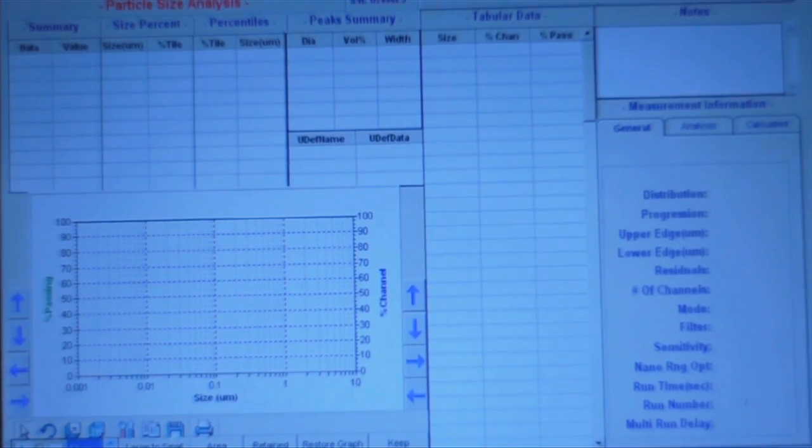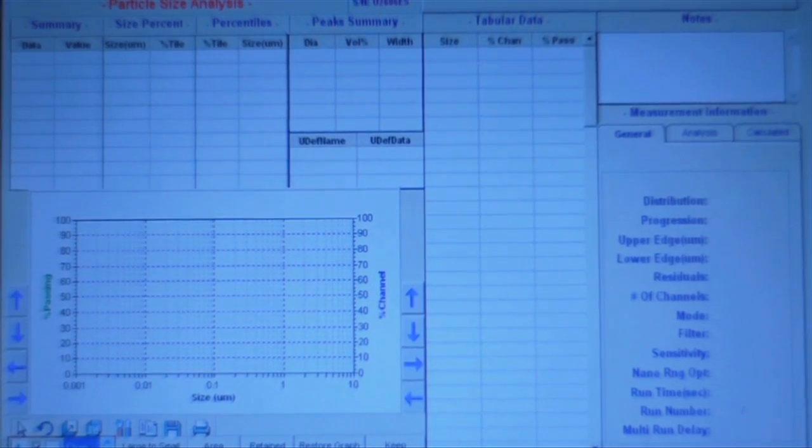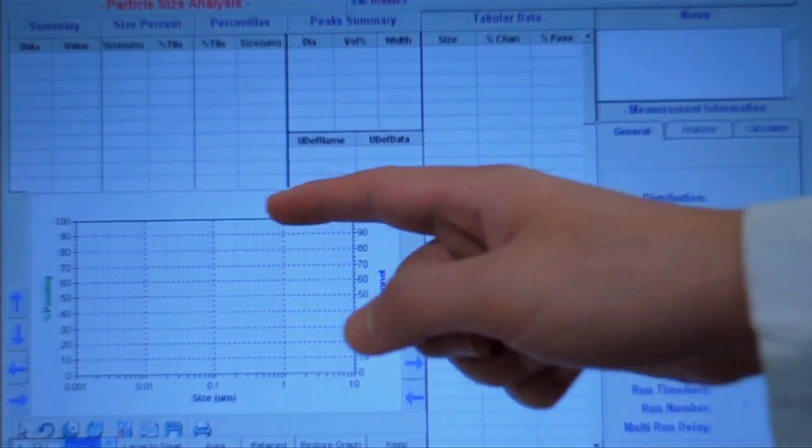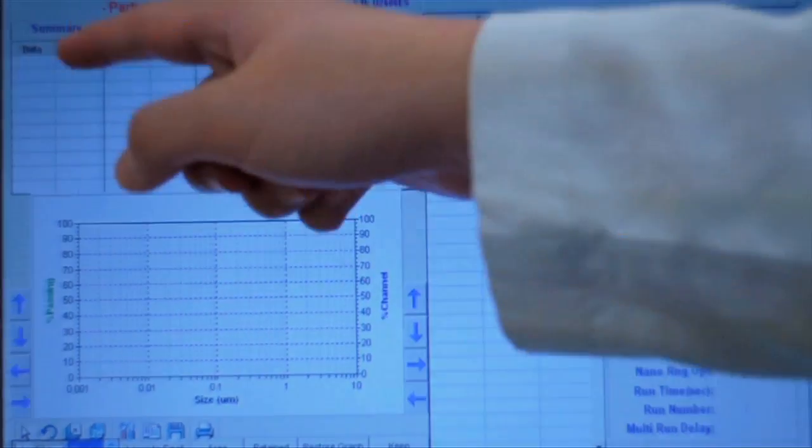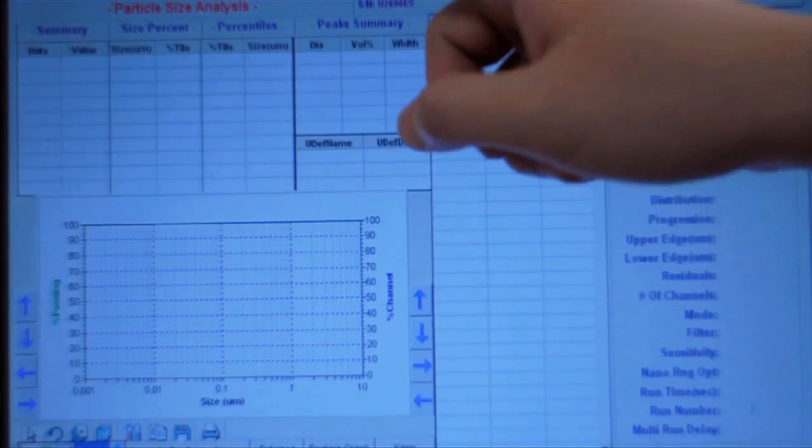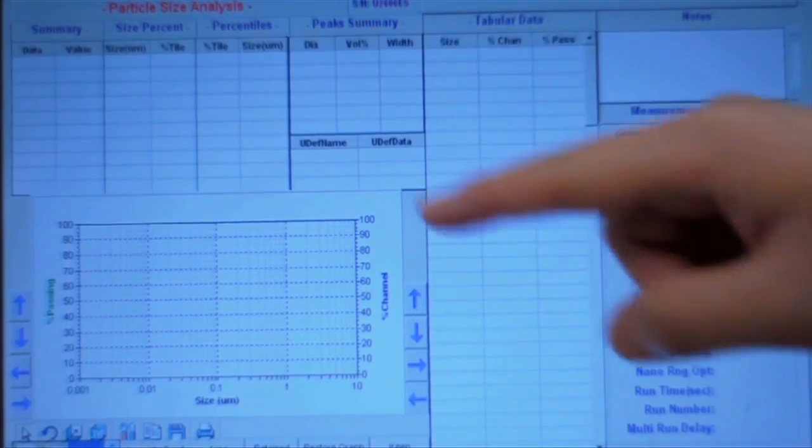This is the Flex software that comes with the Nanotrack. It is 21 CFR Part 11 compliant. The software displays various information about the analysis such as distribution curve, a summary of the statistical data such as average particle size, sizing information such as D10, D50, D90, and details about the peaks.